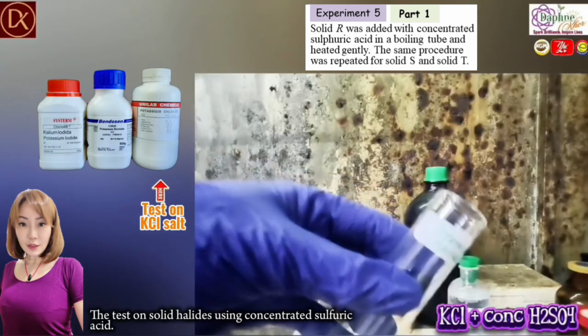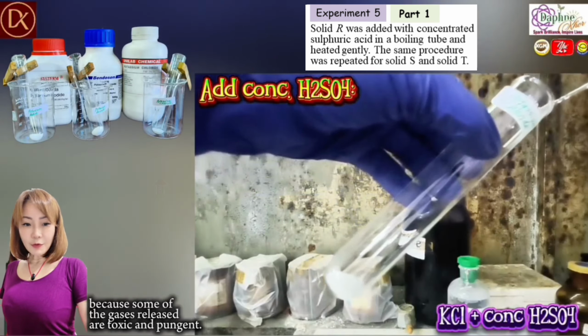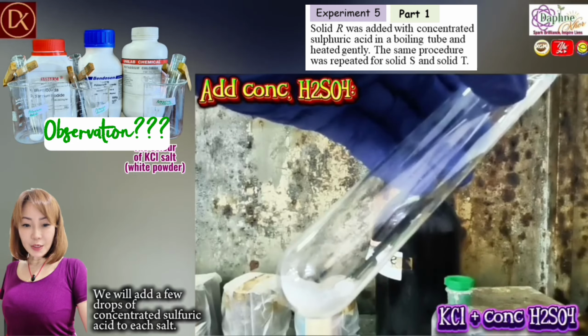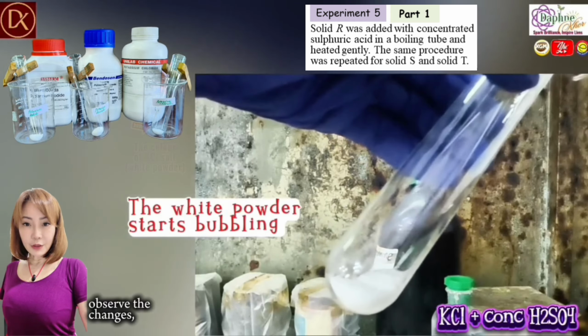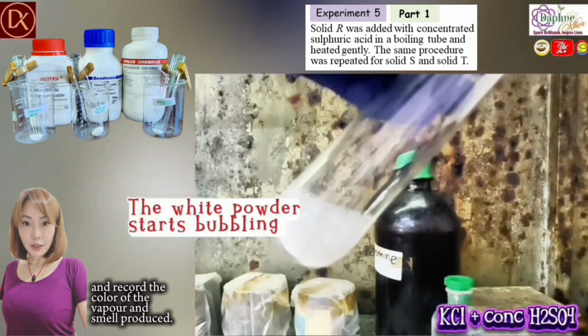Now, let's go to Part 1, the test on solid halides using concentrated sulfuric acid. This test must be done in a fume chamber because some of the gases released are toxic and pungent. We will add a few drops of concentrated sulfuric acid to each salt, observe the changes, and record the color of the vapor and smell produced.